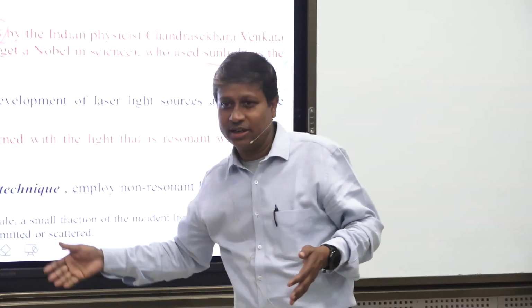But this spectroscopy was not that popular. Nobody was carrying out Raman spectroscopy until the 1960s. It is a big time, 1930s to 1960s. Thirty years is not a joke, no? Because nowadays a super-resolution spectroscope comes into the market within 10 years. Whatever happens in the lab, if that work is recognized by somebody like the Nobel Prize Committee, then it comes to the market almost immediately, within 5 years or so.